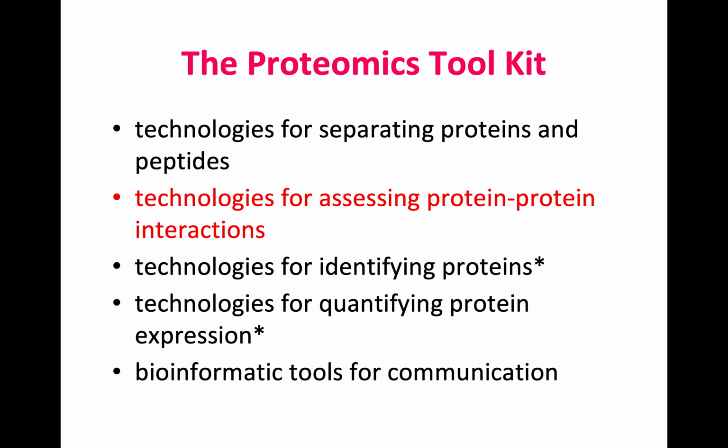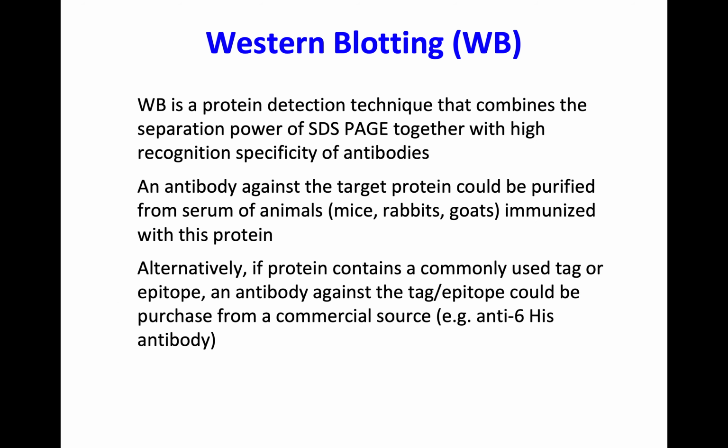The proteomic toolkit that we're going to cover today is for assessing protein-protein interaction, and along the way, for identifying protein. Later on we will look at quantification, and from this topic onwards, we will look at some bioinformatic tools for proteomic work. Before we do that, let's have a look at the old method to study how protein is expressed.